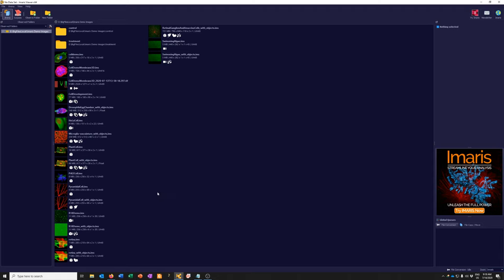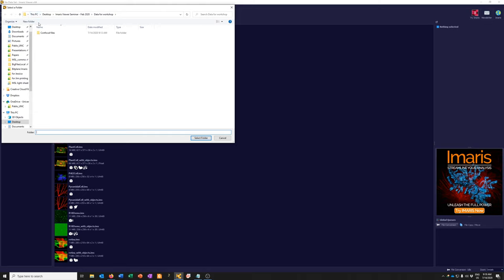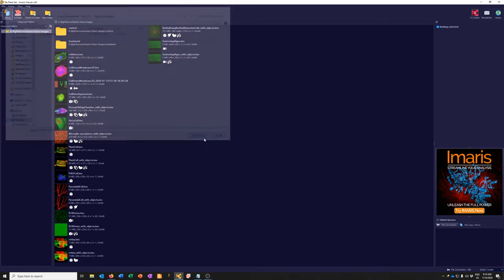In addition to the demo data, you can look at your own data. The way you do that is to put your data in a particular folder that Imaris Viewer can then observe with this nice display. I have on my desktop a folder prepared with a few representative data sets. To add a folder to Arena mode, click here on Observe Folder, navigate to where it is — I'll navigate to the Imaris Viewer seminar folder and the 'data for workshop' subfolder — then click Select.